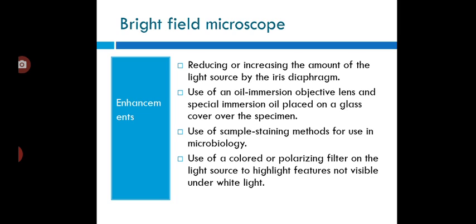So that is the application, limitations, advantages and enhancement of the bright field microscope, an optical microscope which is most commonly used in the lab.